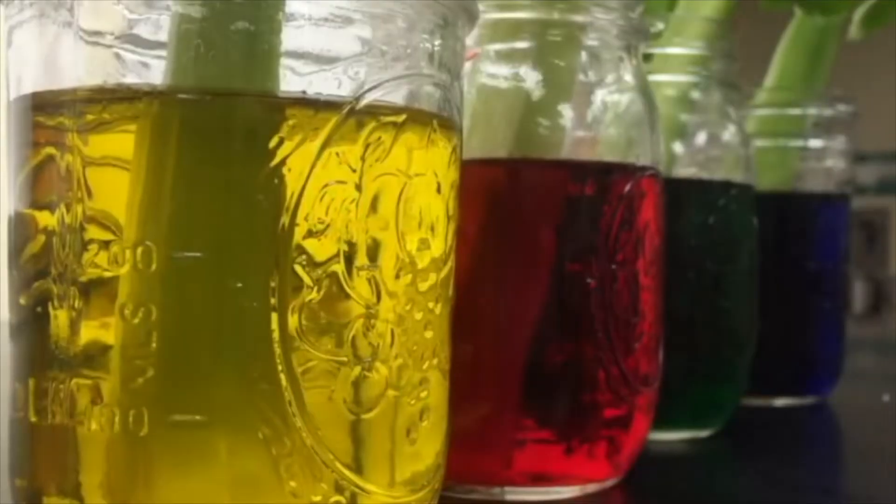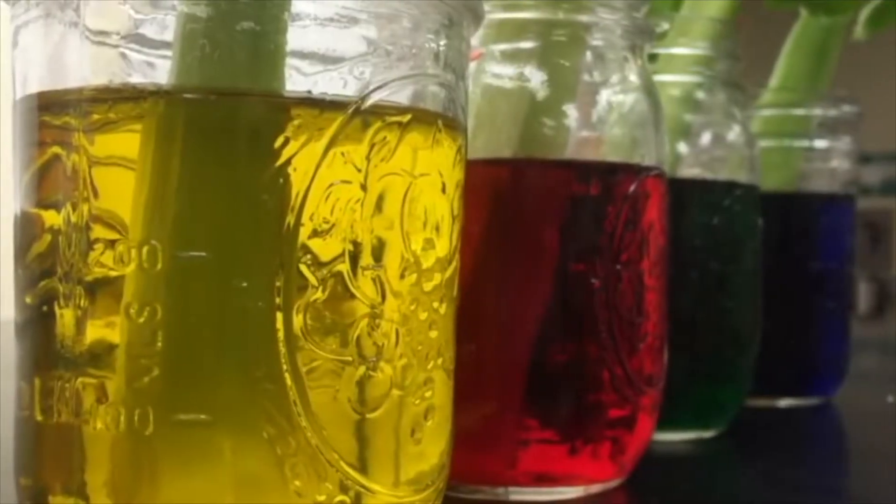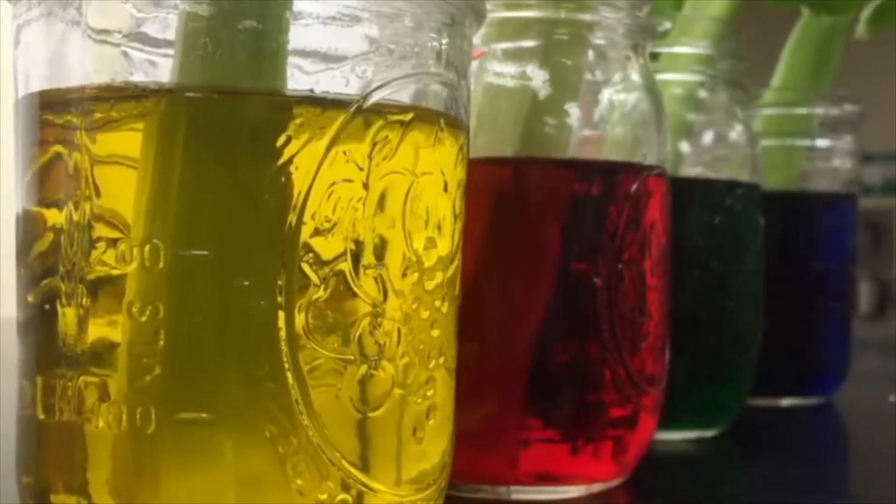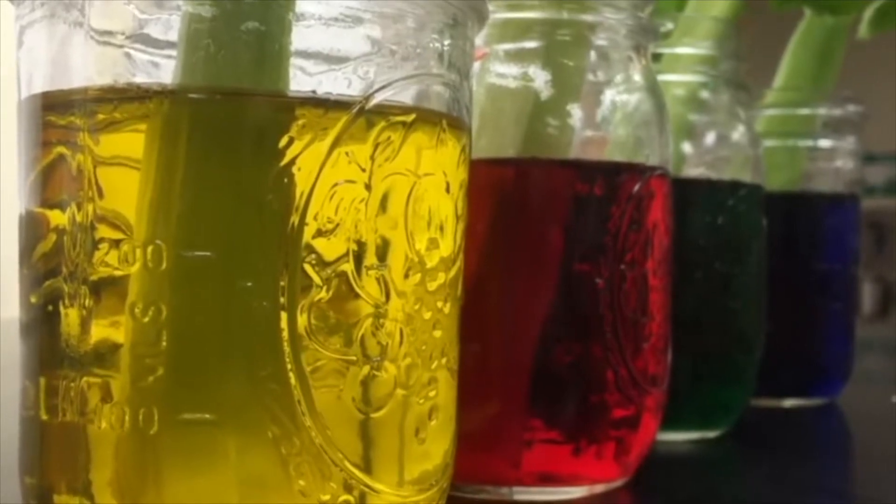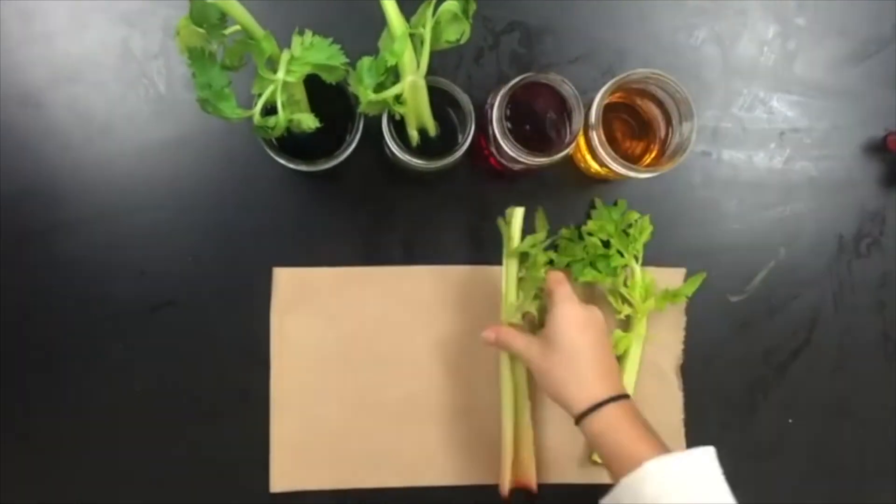Do not remove the leaves. You're going to cut the bottom so they're nice and even and place them in the different colored jars for up to 24 hours. The longer the better.